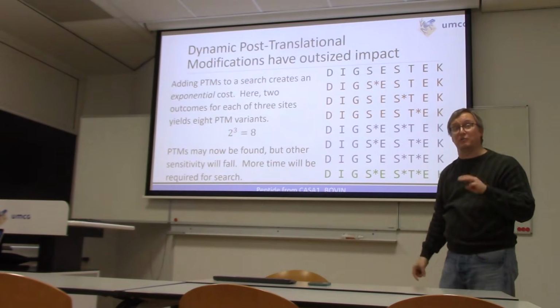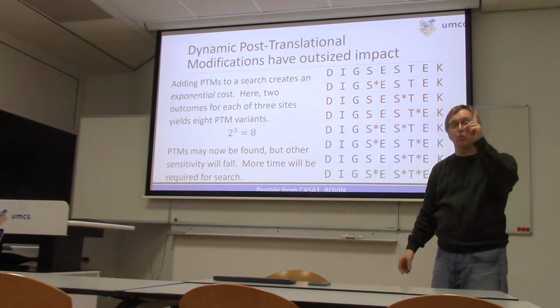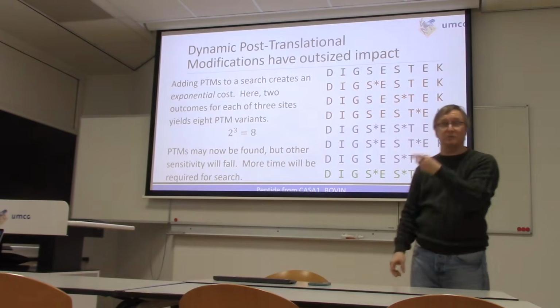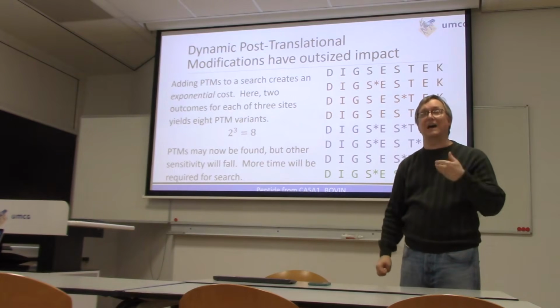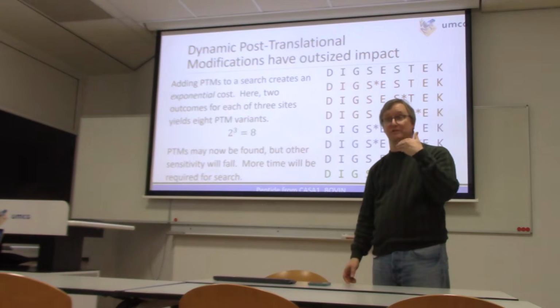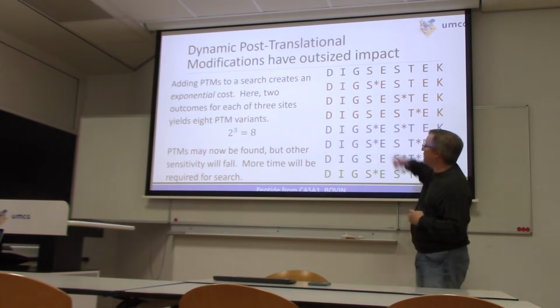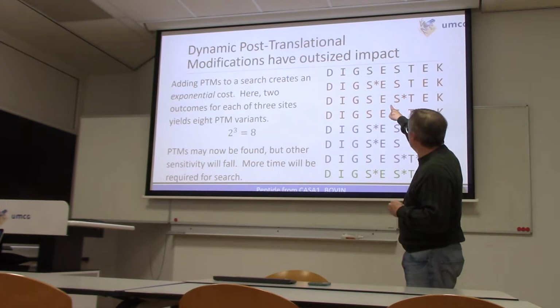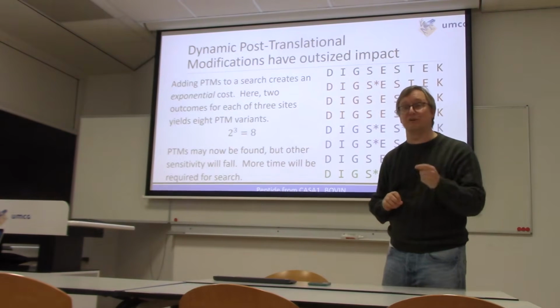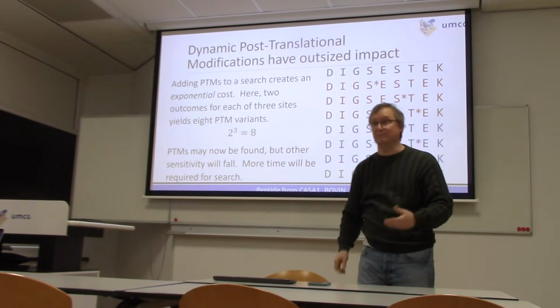The relationship between the three red sequences that follow is that they all carry one phosphorylation. That means the serine or threonine on which those appear has a mass higher than what you would expect for that serine or threonine normally. It gains 80 Daltons because that's how massive the phosphorylation PTM is. So instead of thinking about 87 as the mass unit for the first serine, we might consider 167, 80 mass units higher, for the serine when it is observed in the modified state.